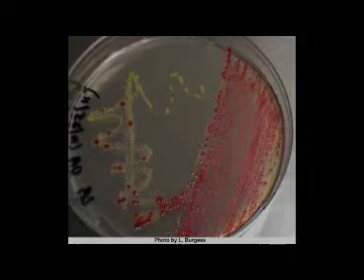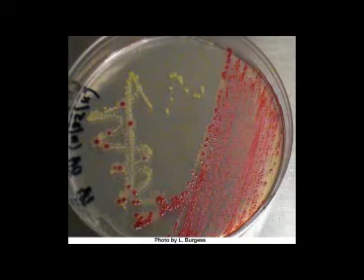You will want to look for differences in the growth. Those differences can be color, texture, and morphology of the colonies. Differences in pigmentation can also be helpful in determining which bacteria is which. Here these two bacteria have different textures and morphologies.